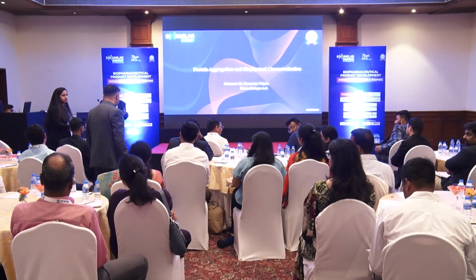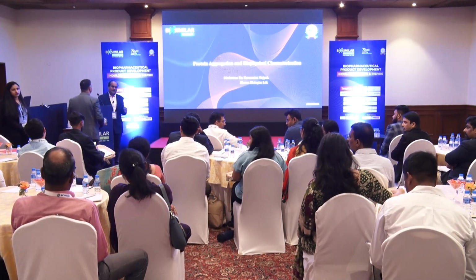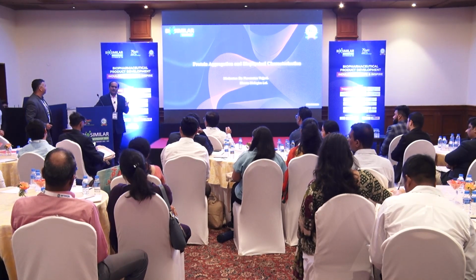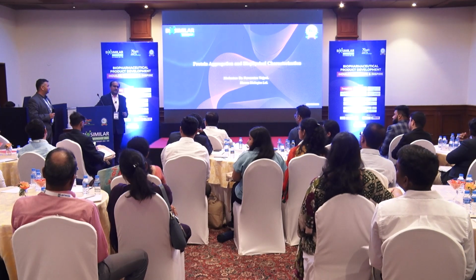For such a study, you require a higher magnetic field. I have a 750 megahertz instrument with both liquid and solid capability. We can spin this microcrystalline formulation up to 42 kilohertz. Typically, we spin at about 33 to 35 kilohertz for proton detection. Proton detection you cannot do at lower magnetic field frequency.